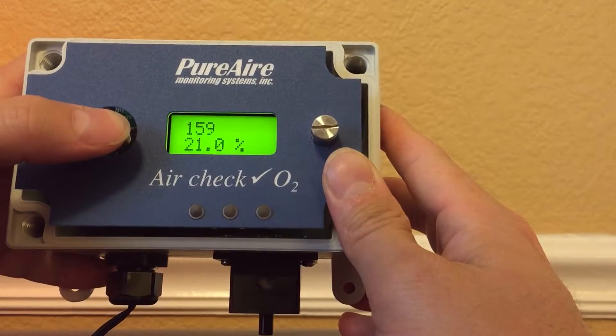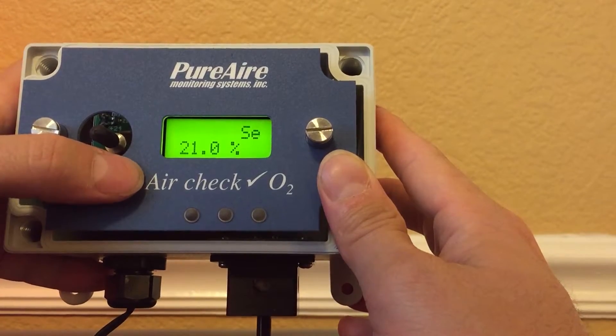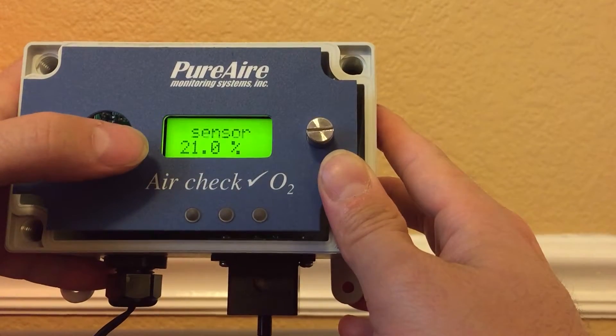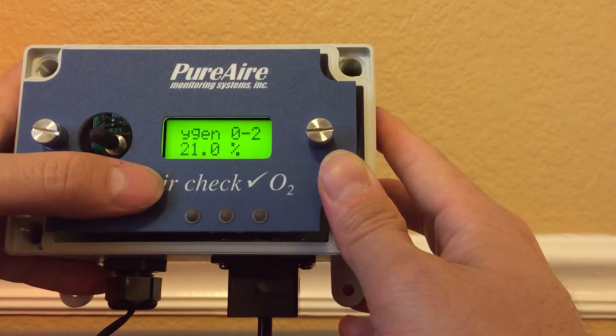I'm going to lock it in by pushing down, and then you have set your new sensor reading — that is it. Cursor to the left to get out of the menu.